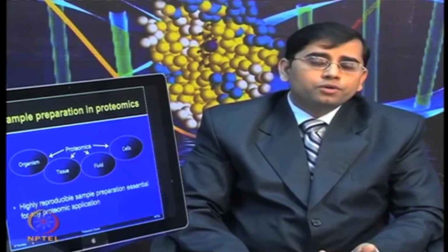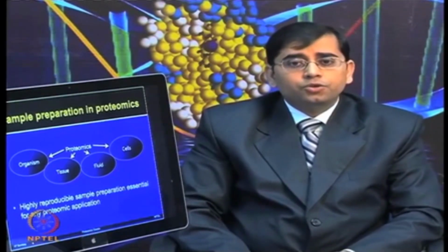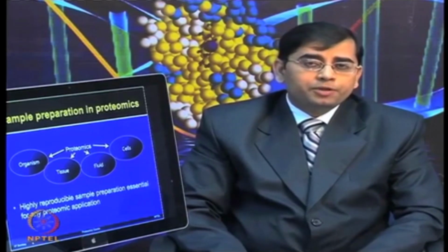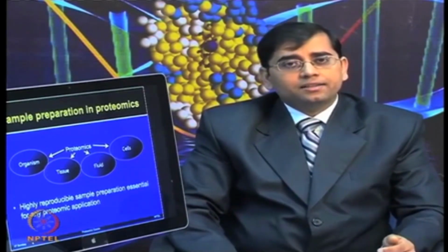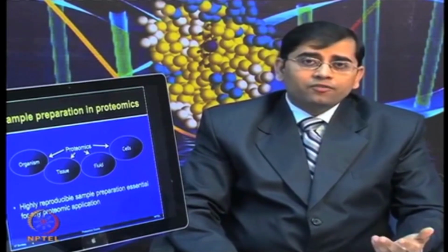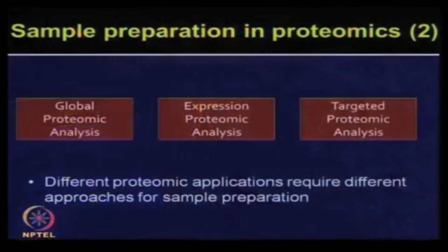If you want to know the difference in your sample as compared to the controls, you need to ensure that your sample preparation is very reproducible. If you introduce some artifacts to begin with, then obviously you are not going to identify the reproducible biological changes. So, let me give you 3 different terminologies here for proteomic analysis: global proteome analysis, expression proteome analysis and targeted proteome analysis.